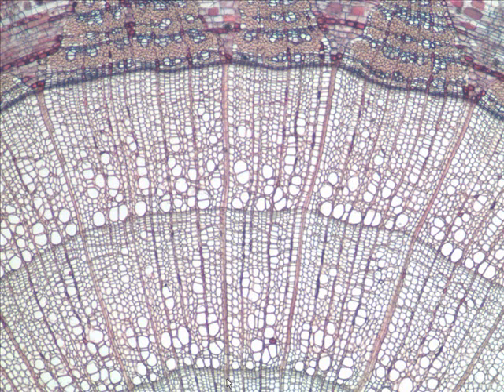Here the bottom is ring 1, the middle is ring 2, then ring 3. And what is this across here? This dark stained layer right across here. That is what? The vascular cambium. Yes. All right. And so we have this ring right here, the outermost ring of what?